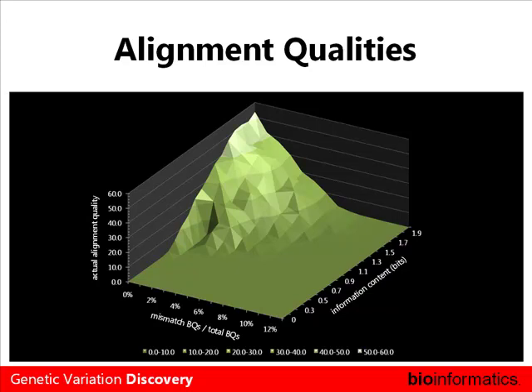One is information content, so that's basically an application of Shannon's entropy. The other one is if you take the sum of all the mismatched base qualities and divide that by the total sum of the base qualities, you see that you have a very well-formed distribution here. You have a curious little aberration there. But we're basically using this model now to investigate how it looks when you have different read lengths and different reference lengths to see if that also poses some kind of problem.